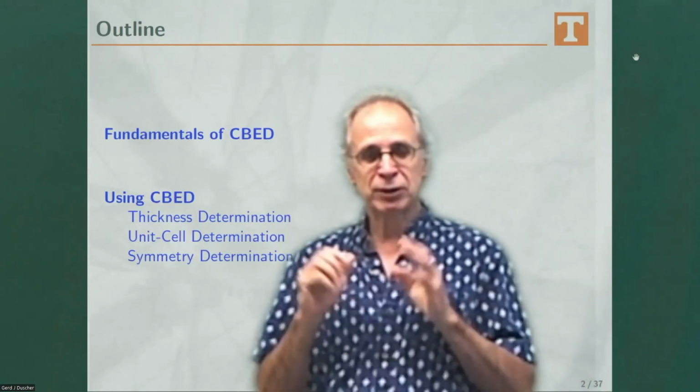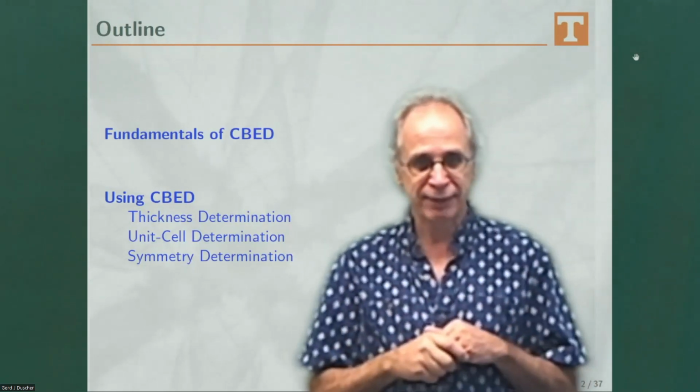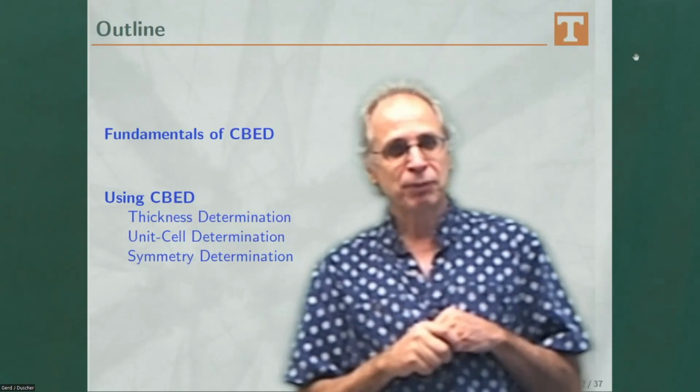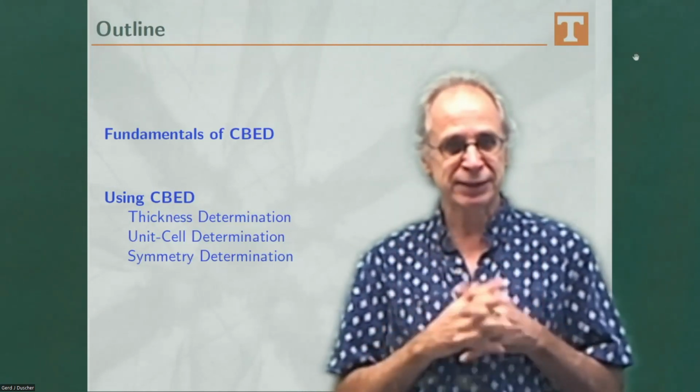We talked about imaging, we talked about EELS, we talked about how accurate we can get that. There are two things missing still. One is diffraction by itself.